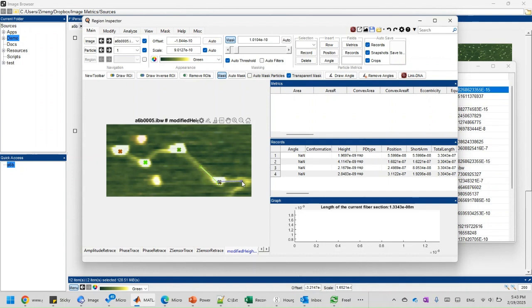And to draw that, just start from the center of the protein and draw towards the edges. So you draw the first one, then you draw the second one, and then it will show the numbers of the bend angle. Now this is not the exact bend angle; it's the angle between the two DNA arms. The bend angle is 180 degrees minus this number. That's the deviation of DNA from its original path. That's the bend angle, so we're going to use this one.